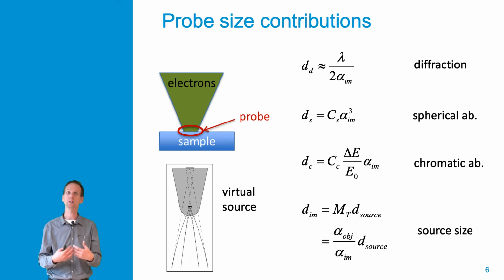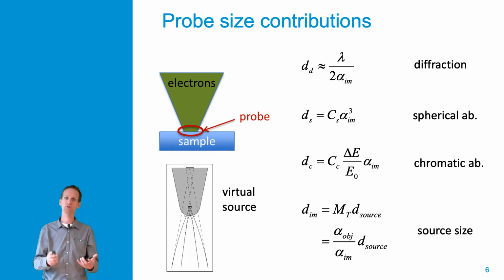This also means that there is a larger difference in energies between the different electrons, so a larger energy spread. Of course, if we would have a cold tip, a cold field emitter, the energy spread would be much more reduced, but we could extract maybe fewer electrons from the material, or we would have additional ways, except for heating, to extract the electrons.